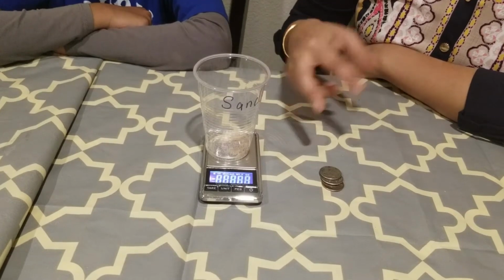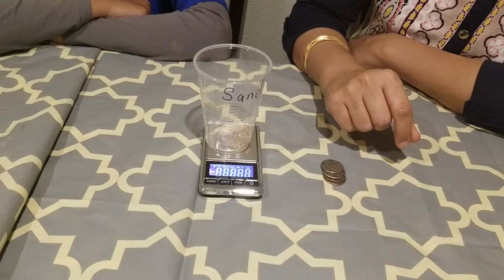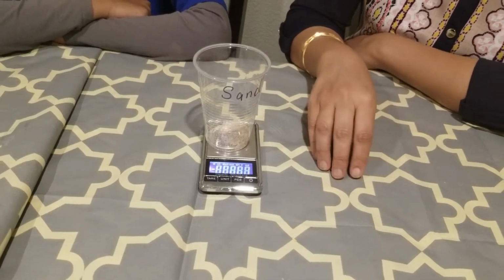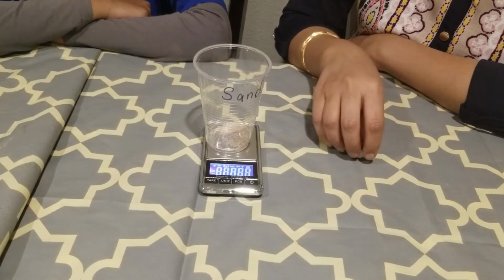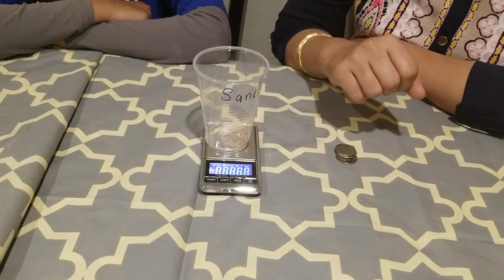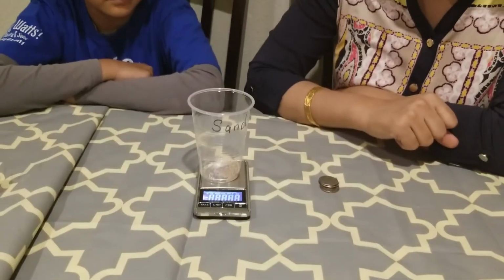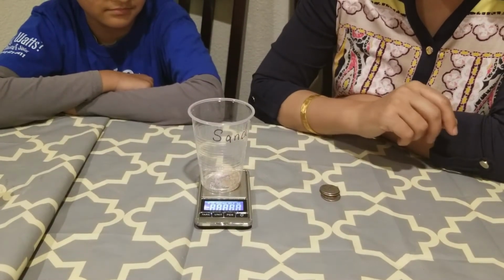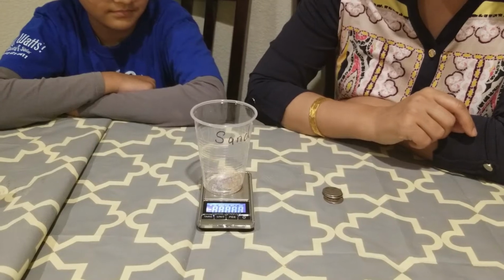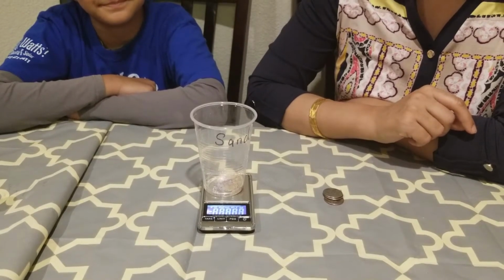So Ima, what do you think, what can we do with these two measurements that we have? Take a difference. Yes, right. We can take a difference, and if your answer is the same, that we need to take a difference of these two measurements in order to find what is the weight of the salt and sand mixture, then it is correct. So we will take the difference of these two, and that is called weighing by difference in chemistry.